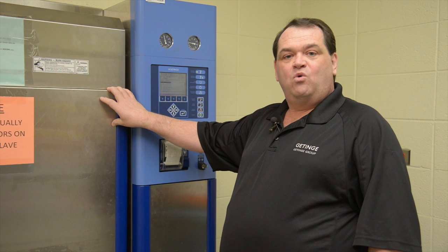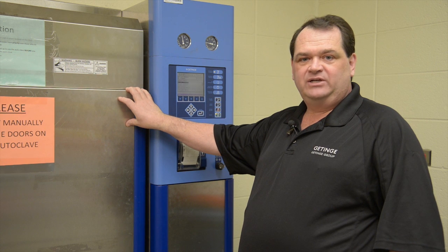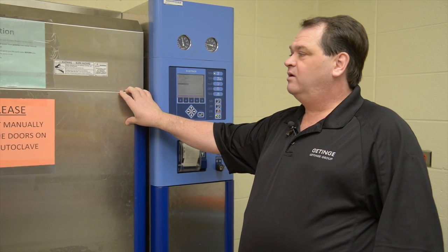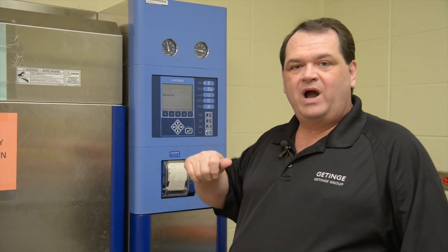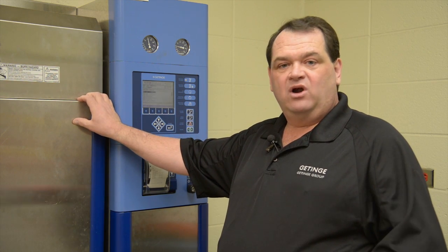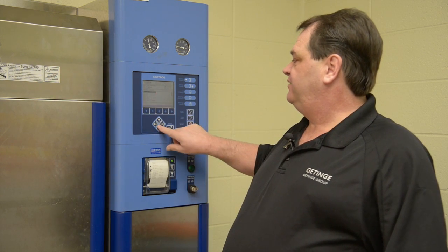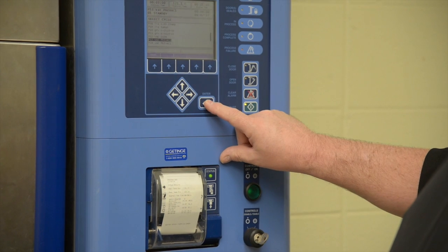In a gravity or vacuum cycle we don't have to worry about the controlled decrease in pressure. The exhaust occurs at almost a wide open rate — it only takes about 10 to 30 seconds to decrease the pressure to a level where we could open the door. Selecting a different cycle, I push down to find the cycle I want, push enter, my door is already closed, my start light is blinking, so I'll restart the cycle.